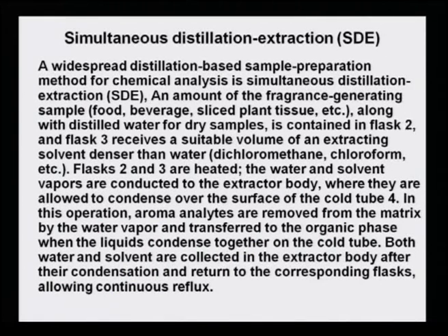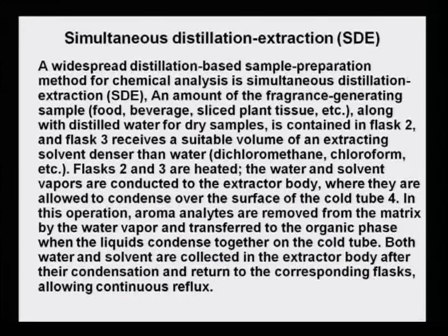So, with this we have come to an end of one particular type of use of the chromatographic techniques that are used in phytochemical analysis. Simultaneous distillation and extraction, SDE. This is also one very special technique which is used in flavor and aroma compounds. A widespread distillation based sample preparation method for chemical analysis is simultaneous distillation extraction. That means, we are distilling and extracting.